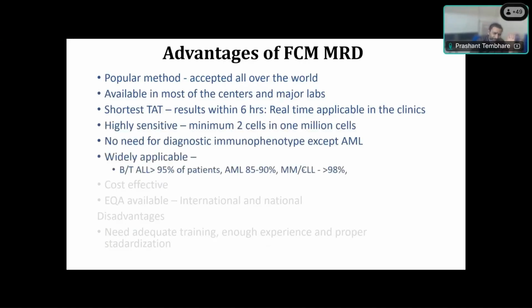It is widely acceptable. It is applicable in more than 95% of cases of BLL and TLL and approximately 90% of AML. It is cost effective. EQA, the international quality control, is available, both national and international. For EQA in India, with Tata Hospital, we run the EQUAS program for MRD, for all types of MRD, BLL, TLL, AML, myeloma MRD, and now we are going for even NABL accreditation for proficiency testing.